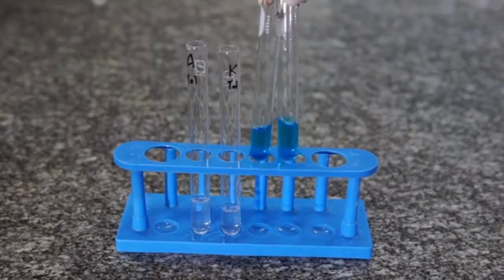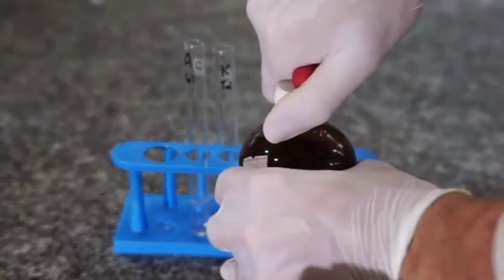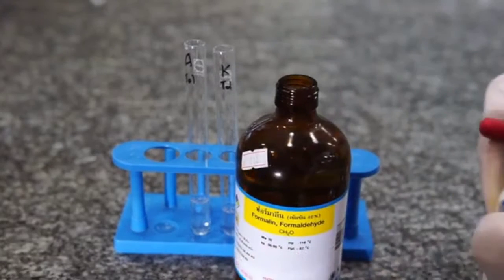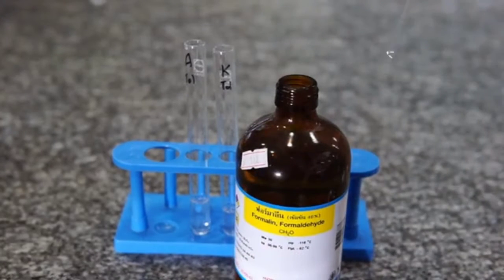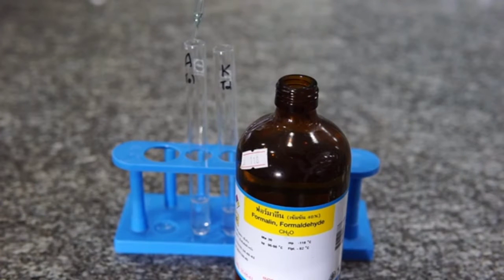Just as a comparison, I've also got the Benedict's, which I prepared earlier. First of all, we add some aldehyde. You can see that the aldehyde has reacted as soon as it's been added to the Tollens reagent.